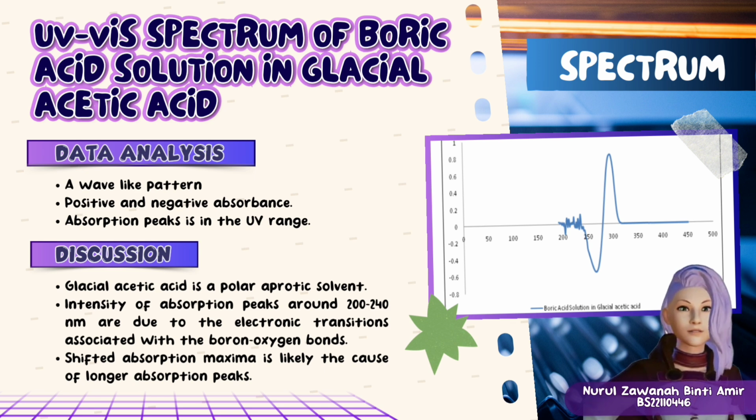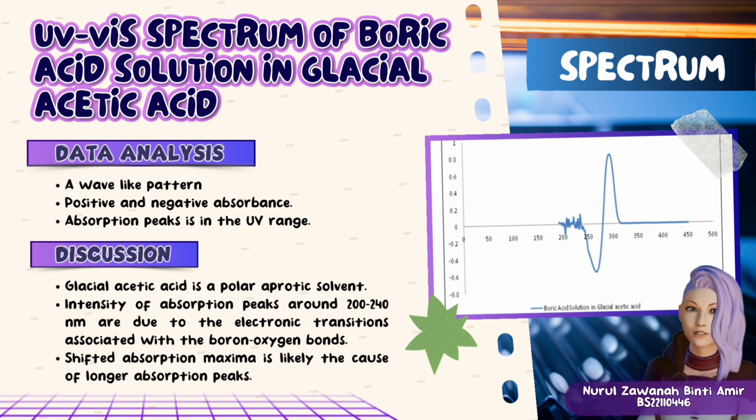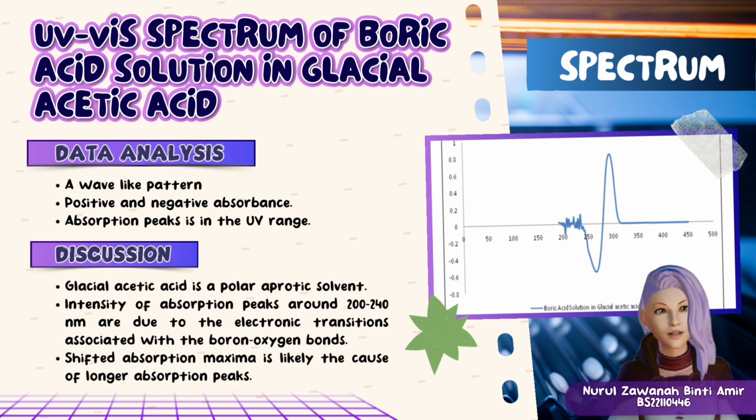The data observed shows that the spectrum has a wave-like pattern, which in turn gives it positive and negative absorbance. The absorption peaks, as can be seen, are in the UV range, around 200 to 240 nanometers.